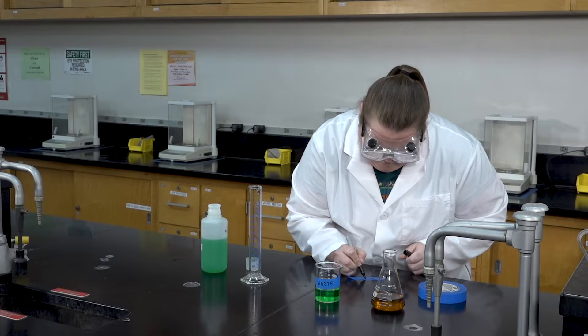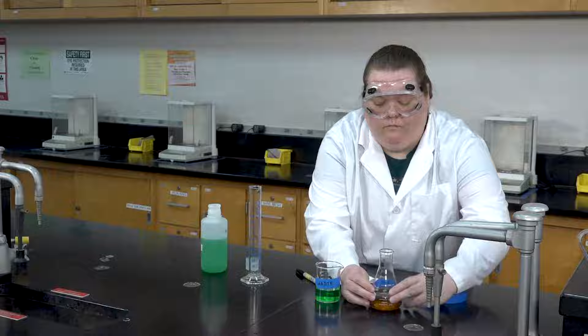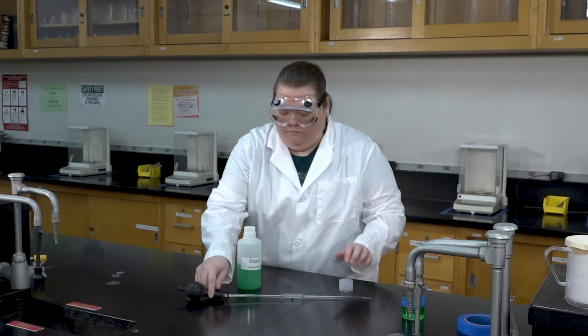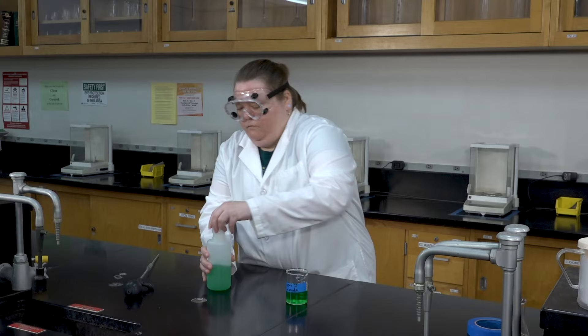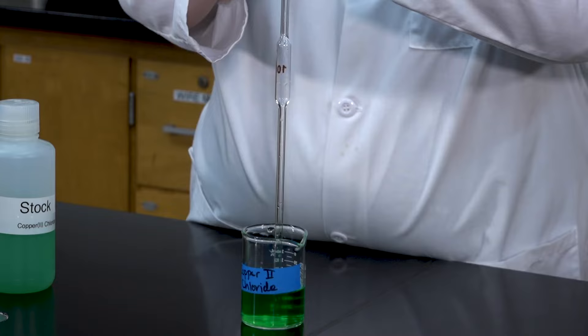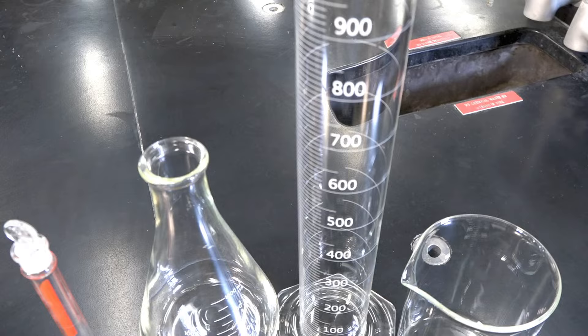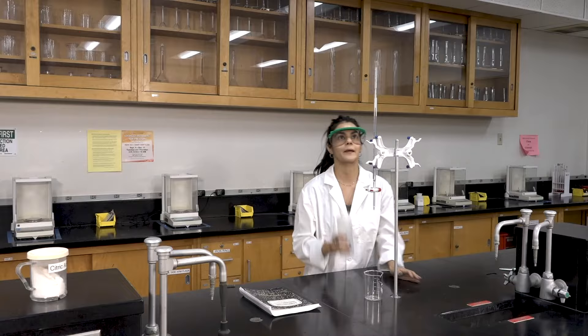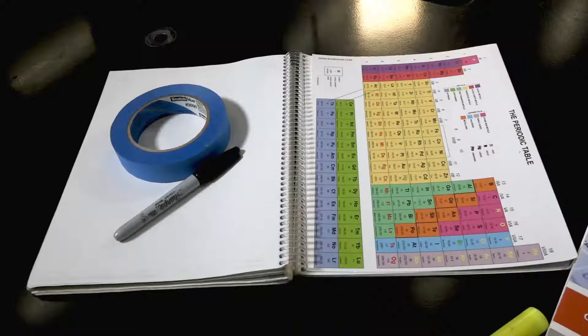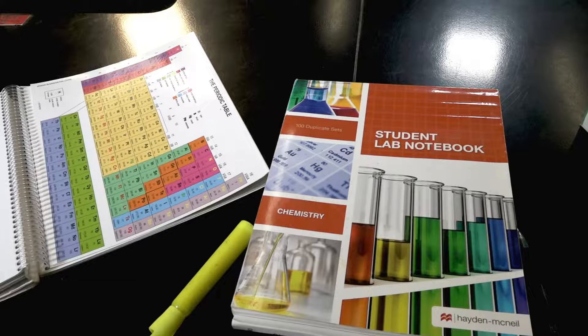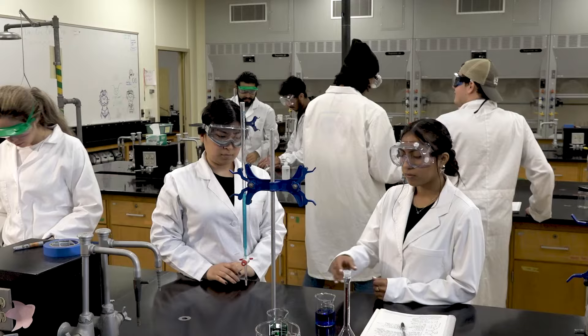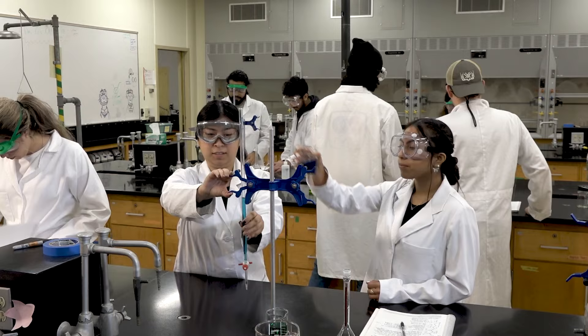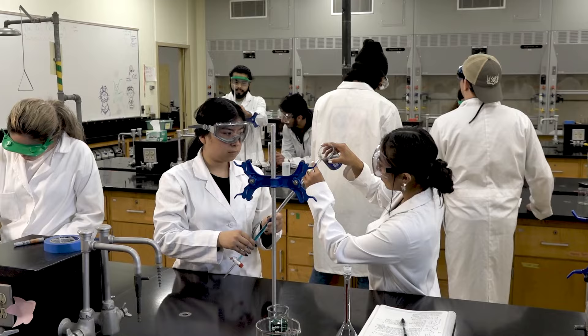Always label your glassware with its contents using label tape and a sharpie. A pipette is a commonly used instrument to transfer liquids. Never place the pipette directly into the stock bottle. First, transfer the liquid to another vessel, like a beaker, and draw from there. You will be introduced to a variety of glassware throughout the semester, and an important thing to keep in mind for all of them is to never try to pour from an unsafe position. Always consider the surface below before transferring liquids. It should be free of all material, including your lab notebook. Spilling a corrosive substance on your lab notebook will result in lost work and may even result in having to throw away the notebook. Also, consider your body position when pouring. Do not stand on your tippy toes or excessively reach while pouring. Bring the glassware closer to you so you can pour in a more comfortable, safe position.